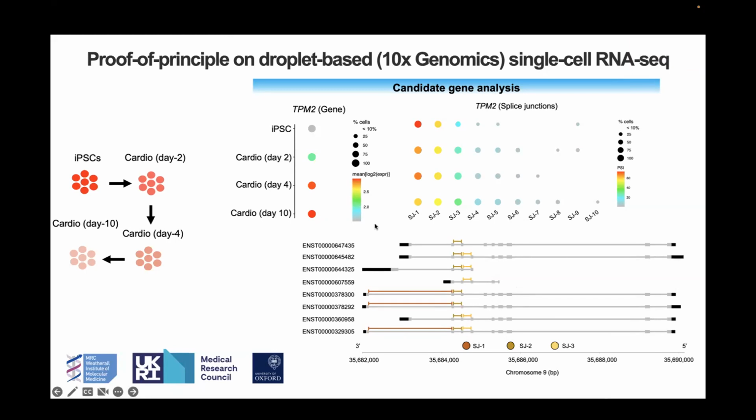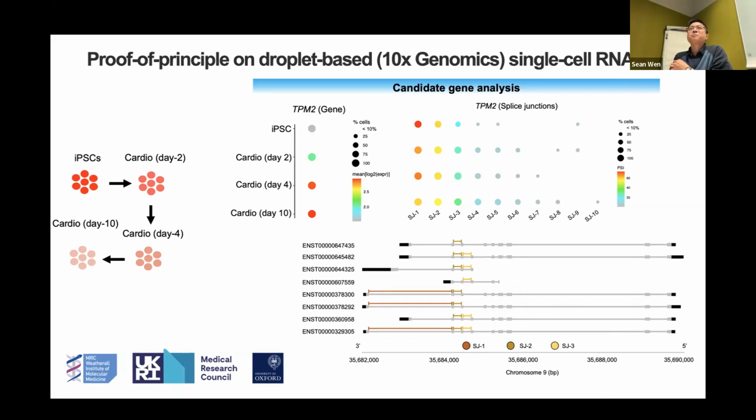Okay, thank you. Great. And regarding my question on gene fusion, is that something that you would consider at some point? So gene fusion, I think it falls under the category of structural variation. And structural variation is always very, very tricky. I would probably consider structural variation not strictly a splicing event, although it is, because you have two genes fused together and you get some abnormal splicing, but I think there are no immediate plans for that at the moment.